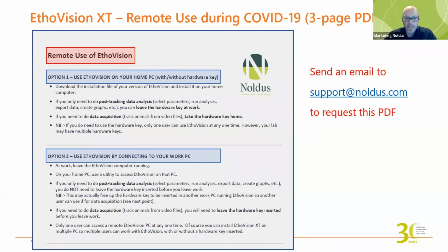Okay, so we have a couple of questions. Well, hold on, I'll answer one first. Can EthoVision be used to track multiple animals in the same arena? Absolutely. That's the one module I did not mention during my webinar.